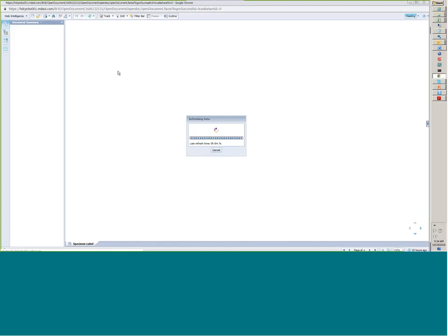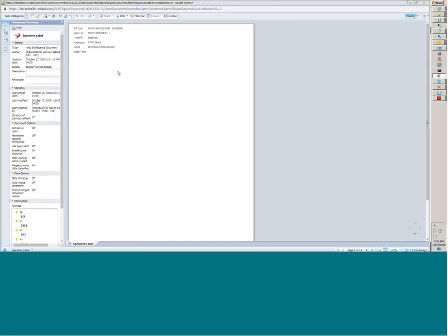In the current plan, we are developing a barcode for these labels. It's not currently implemented yet. So the label that you see here does not have a barcode on it. Eventually, there will be some kind of a barcode in the same area where we've currently got label information for the different fields.